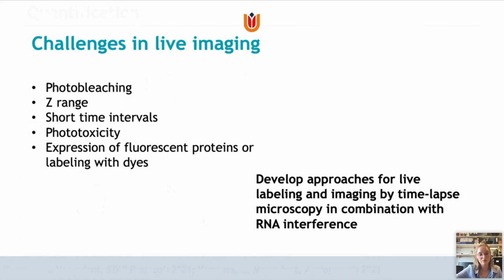This often results also in phototoxicity and cell death, which is what we don't want. Also, to visualize this process, we would need expression of fluorescent proteins, which can be achieved by lentiviral transduction. But this can also be a problem, as HUVECs have a quite short lifespan, as they are primary cells.